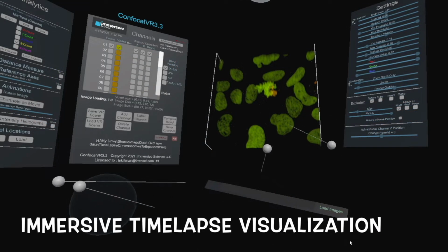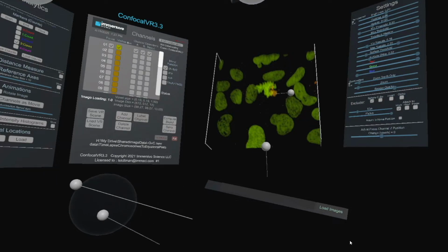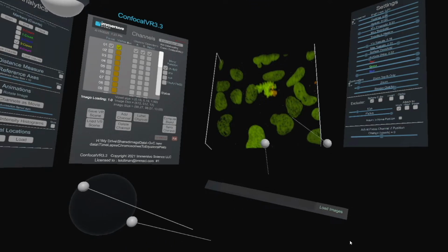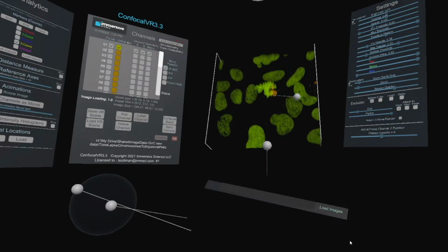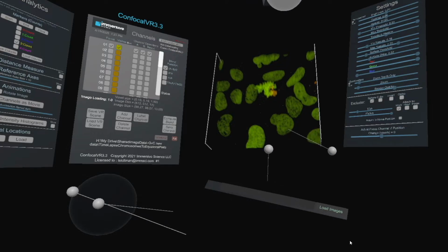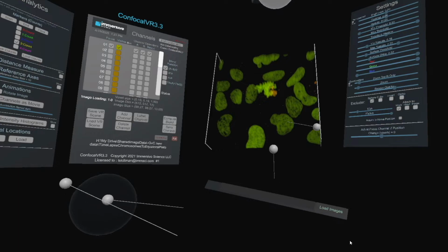These are cells transfected with H2B and Maple. Maple is a fluorescent dye that you can switch from green to red. So what we did here is we switched a few chromosomes from green to red. And then we made a long time-lapse experiment just to see how these chromosomes end up in the daughter cells. Here we do not have the whole time series, but what I wanted to show you is how the chromosomes are going to the equatorial plate, a process that is hard to see in 2D, but here you can really see it happening in 3D.